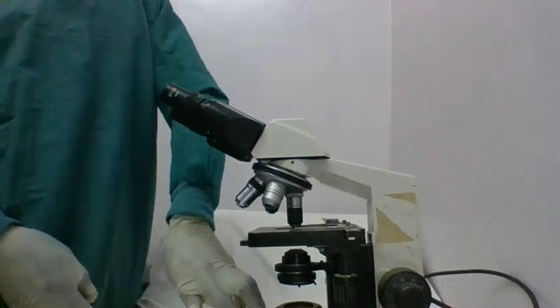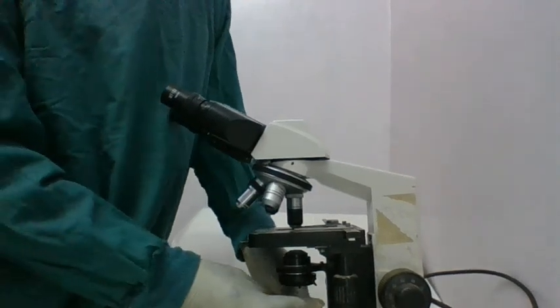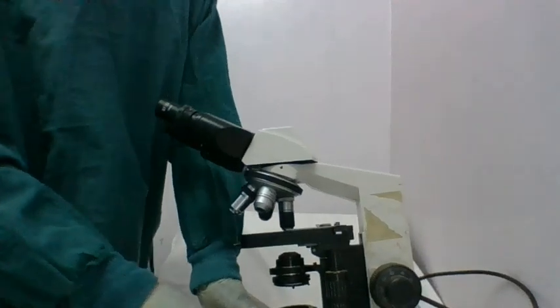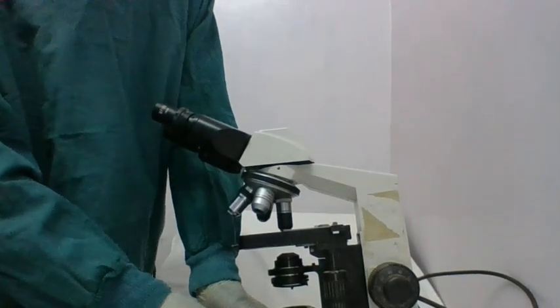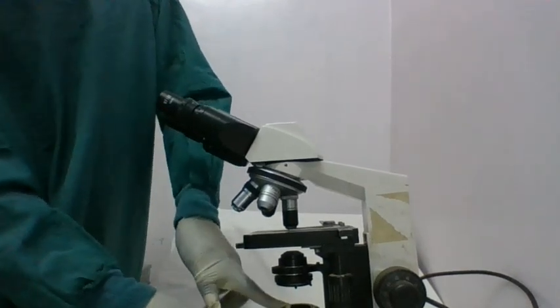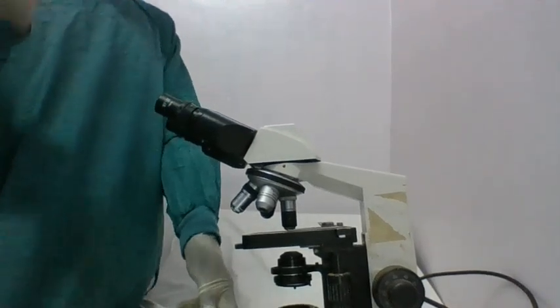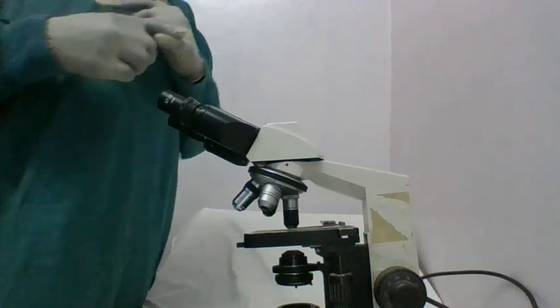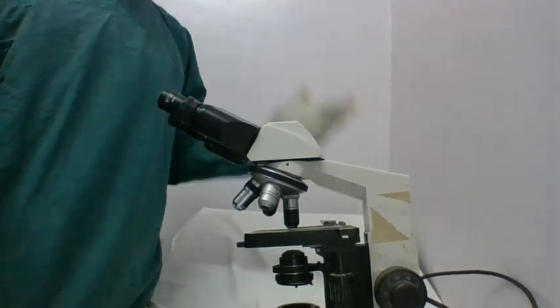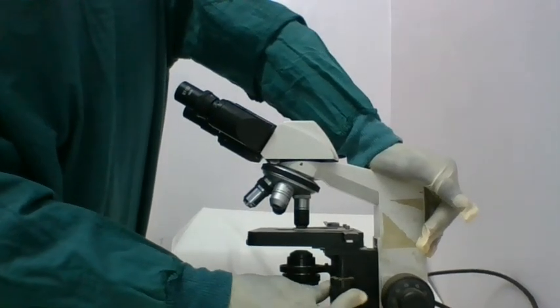You need to have the lighting. Here is basically the bulb. The bulb is down here, guys. I don't know if you're seeing it, but the bulb is down here. When you turn on the microscope, it has its knob here, the on and off knob of the microscope. The moment you turn it on, it's going to light to give the illumination. And remember, guys, how many types of microscope are there? I know you know it. We have the light microscope and the electron microscope. But in today's era, the one we're mostly going to use is the electrical microscope, guys.